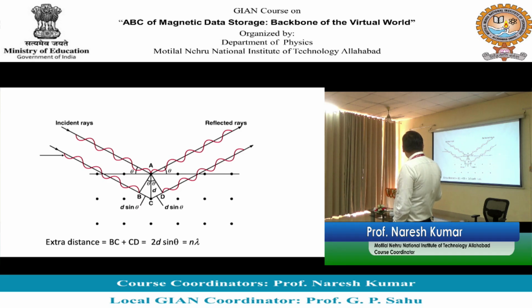फिर मैंने थीटा बढ़ाना शुरू किया, अब की बार क्या हो सर, थीटा इज इक्वल टू 20 डिग्री पर क्या हुआ, 2d and sin 20, it gives you what? 2 into 1.54. Then at that theta, whatever maxima you get, what is that? अभी यार याद कीजिए, मैंने थोड़ी देर पहले इंटरफेरेंस एंसलिट का मैक्सिमा बताए थे. n इज इक्वल टू 1, फिर 2, फिर 3, और इंटेंसिटी कैसे गिर रही थी ना. So when n is equal to 1, intensity will be very high.